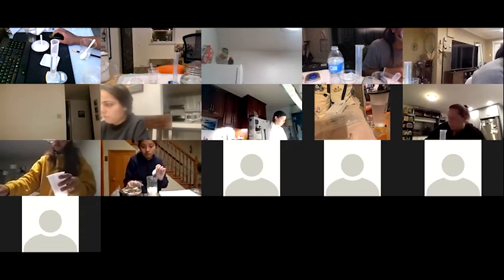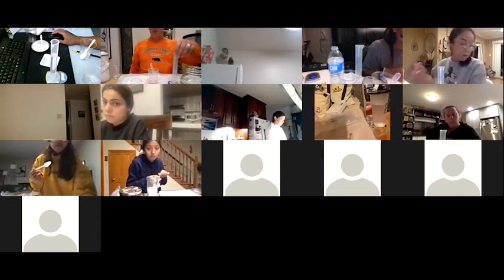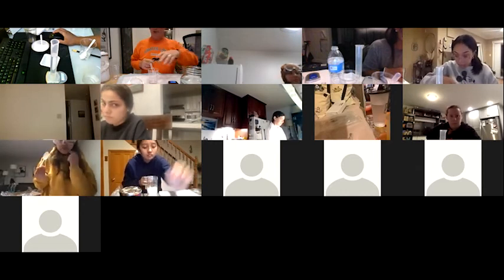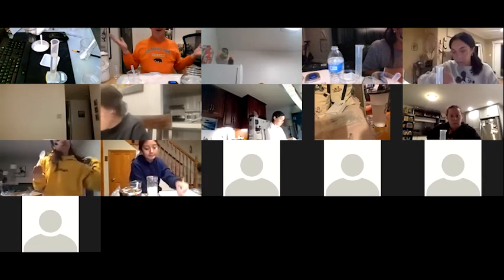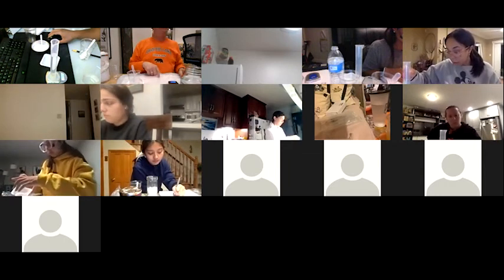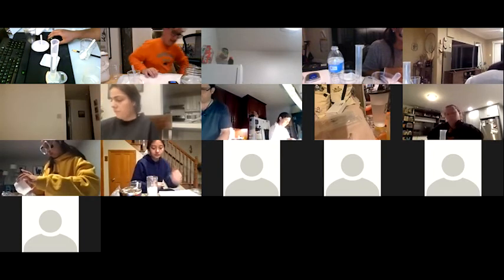Should we note in our notes if it's not exactly 50 grams of water? Definitely. Yeah, that's what taking notes is all about. Because one of the questions in your report is going to be, can you determine what the source of some of the errors are? If you're going to have errors, everybody has errors. And if you take really good notes during your experiment, you'll be able to refer back to it. Oh, right, I did that. Or, I threw my cup across the room. So, stuff like that.